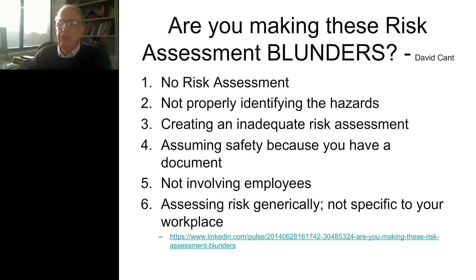I know people who use cell phones to look up recipes while they're cooking dinner. So if you have your cell phone in the lab all day, and then you go home and use your cell phone while cooking dinner, you risk contaminating your food with what you've worked with. If you've worked on the enteric bench that day, it's not a good idea. There's an ongoing outbreak with salmonella because of people taking things out of the laboratory into where they're eating. So you definitely need to be concerned about cell phones, and restricting cell phone use in the laboratory is a very wise thing for a laboratory to do.